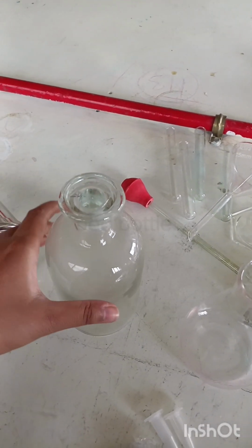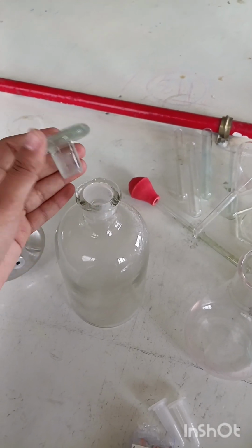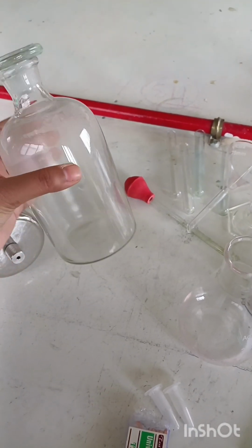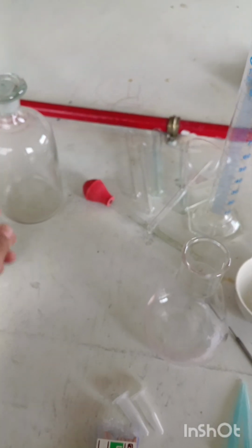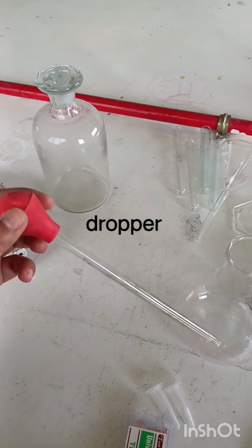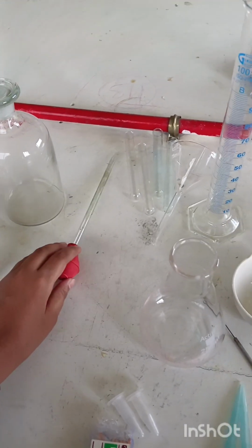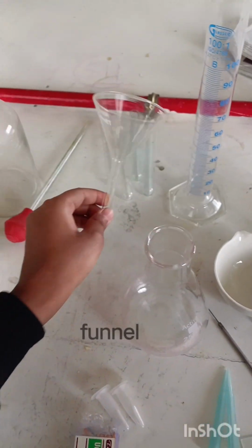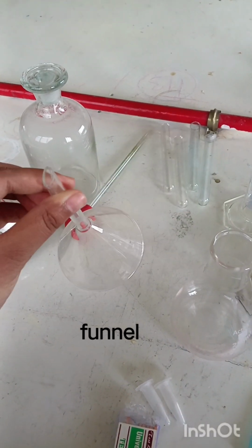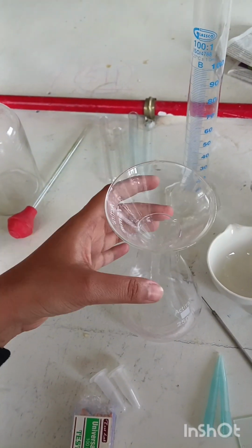This is a BOD bottle, used for measuring biochemical oxygen demand in a water sample. This is a dropper, a simple tool for transferring a small amount of liquid drop by drop. This is a funnel, a tube with a wide top and narrow bottom, used to pour liquid into containers with a small opening.